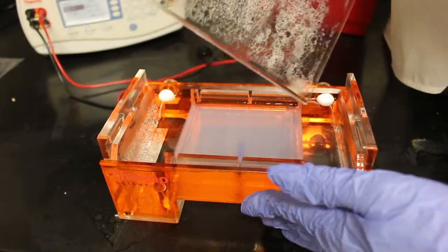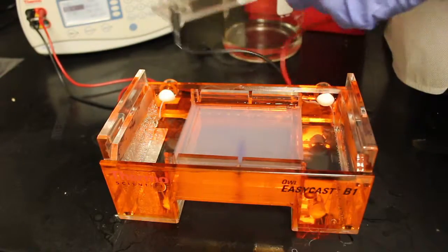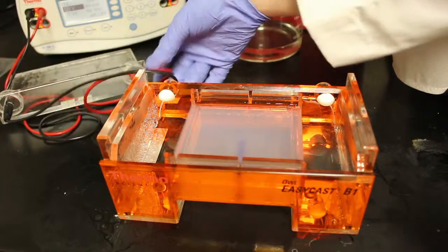Carefully remove the power source from the chamber and ensure that it is no longer outputting electricity. Carefully remove the gel with its mold.